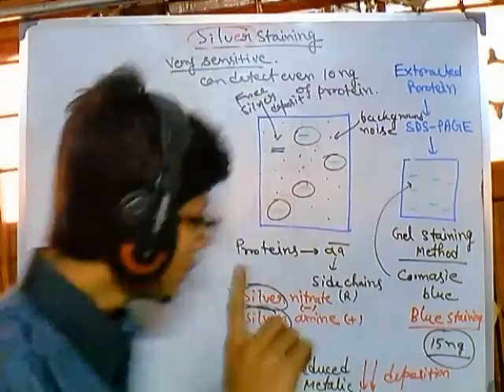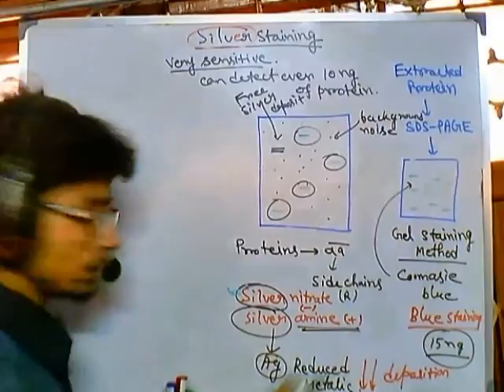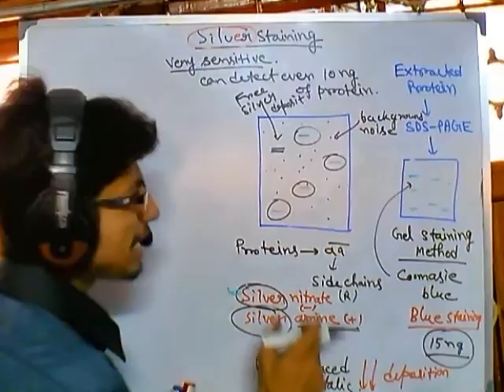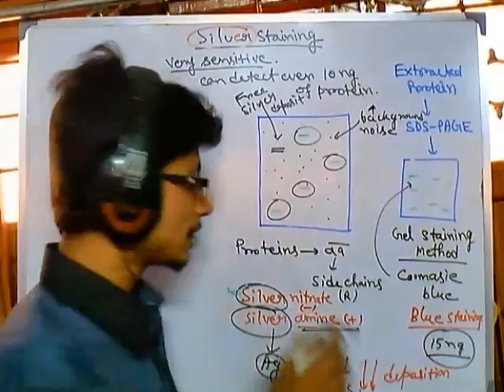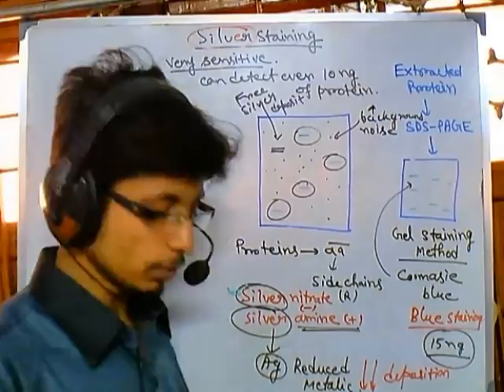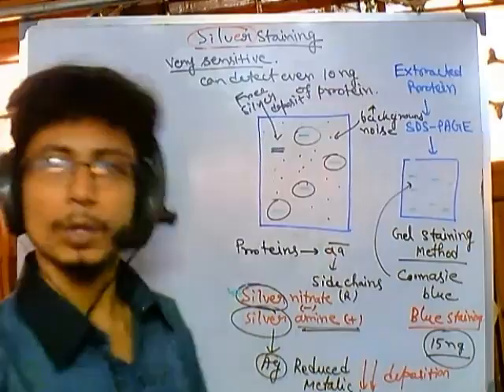Now, if we use silver amine, which is a positively charged stain, it has less sensitivity, because this stain has a slightly higher background noise. On the other hand, silver nitrate has less background noise, which makes silver nitrate a better stain than silver amine. So nowadays, in most cases, we use silver nitrate for the staining of this gel. This is the basic process of the staining.